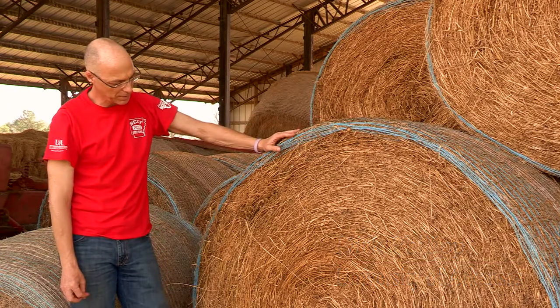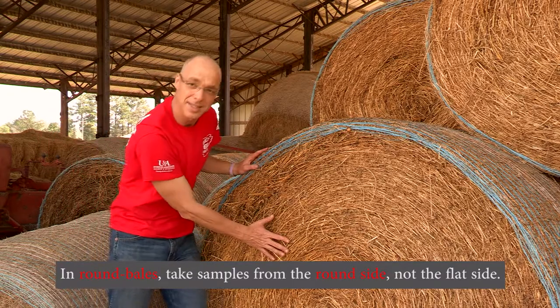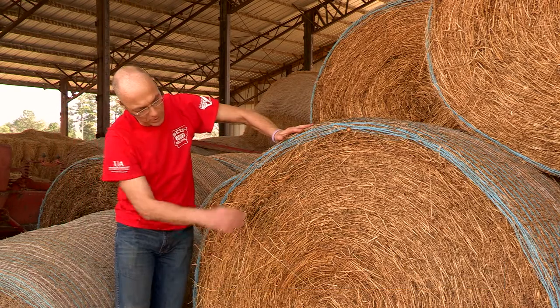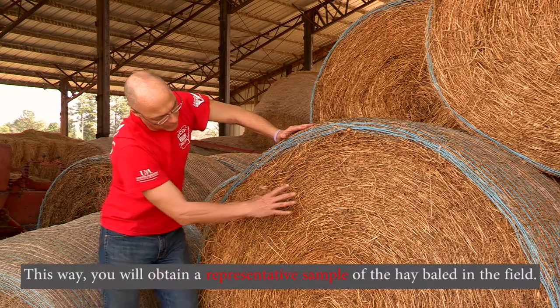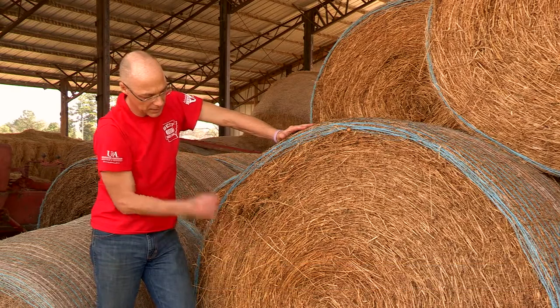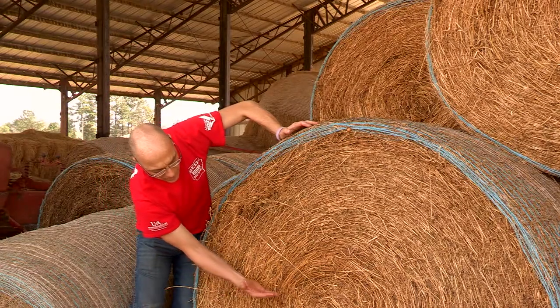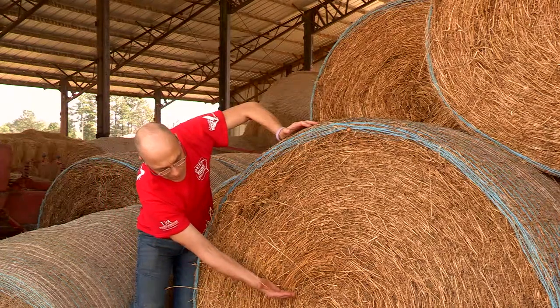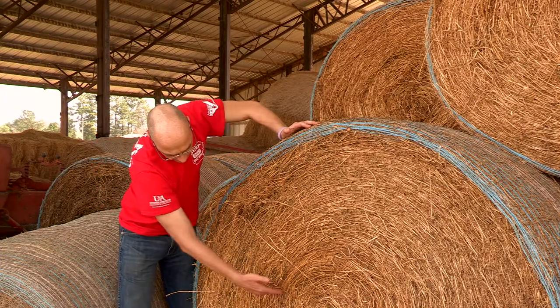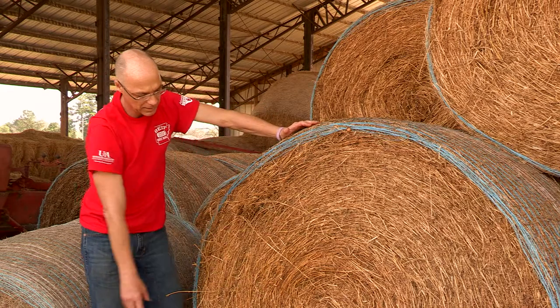Whenever we take samples from round bales, make sure you do not take them on the flat side — take them from the round side. When you look at the bale, whatever is rolled up comes from an entire row or more from the field. To get a representative sample, you want to sample right through all those flakes and the entire row baled up. Always take from this side, drilling as far into the bale as you can.